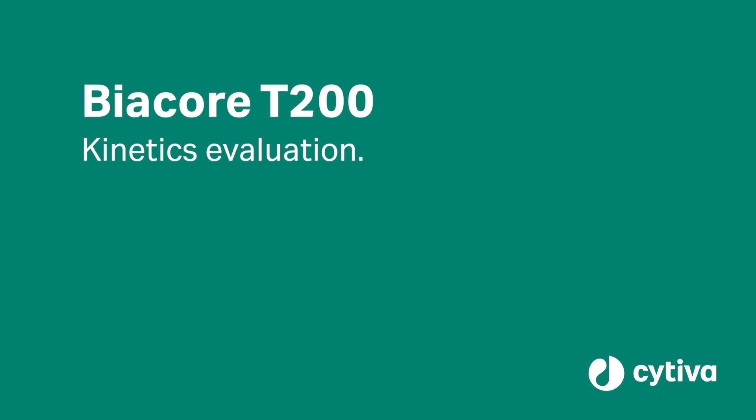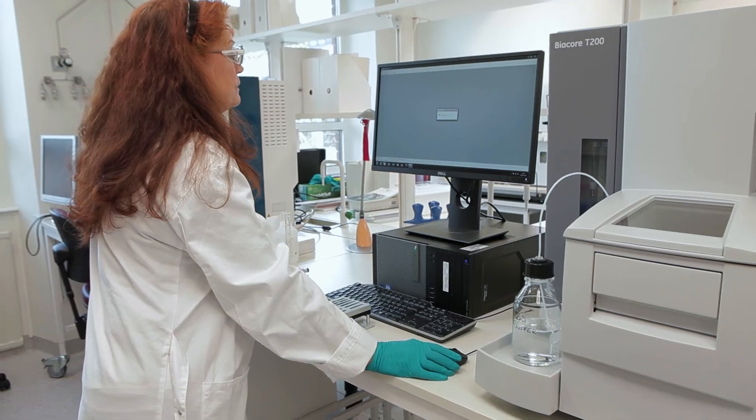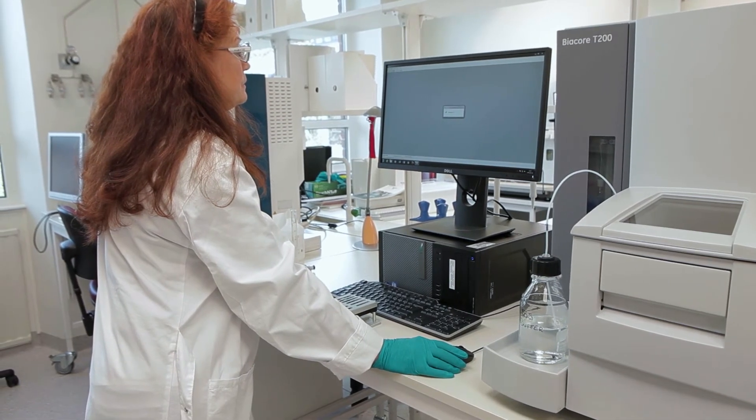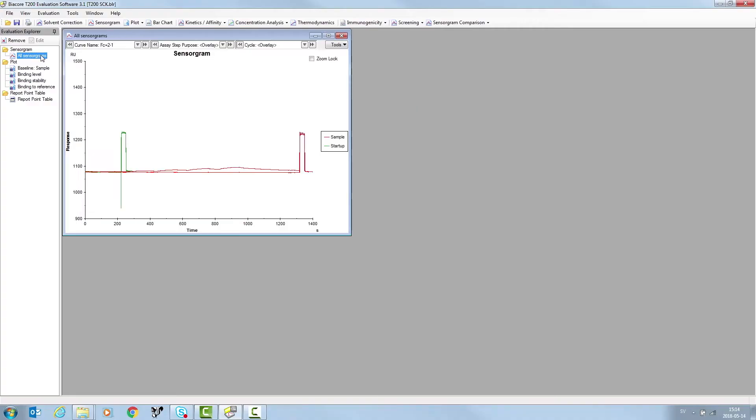Kinetics Evaluation. Open up your run file in the Biacore T200 evaluation software. Startup and sample cycles are displayed.